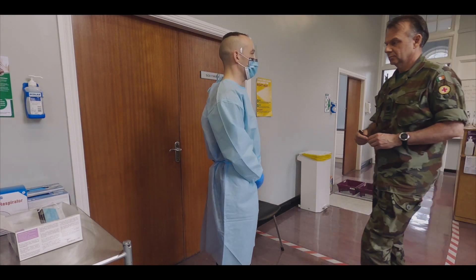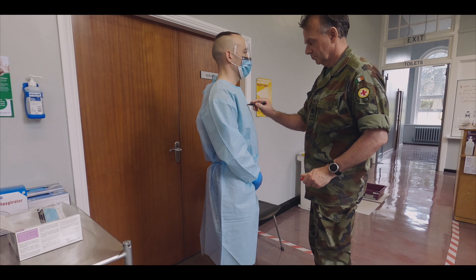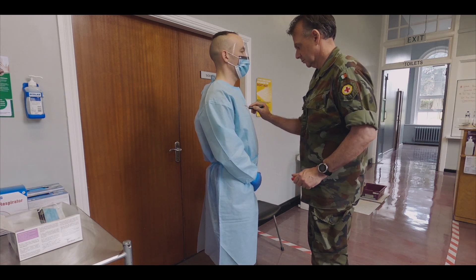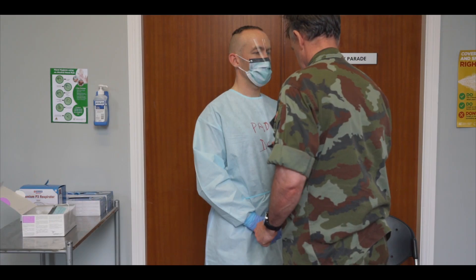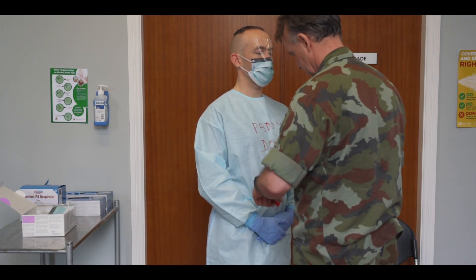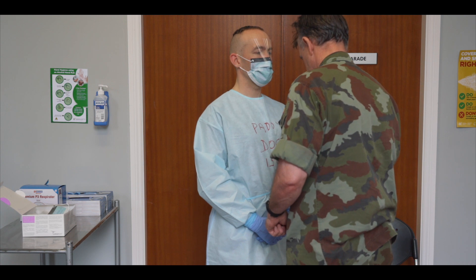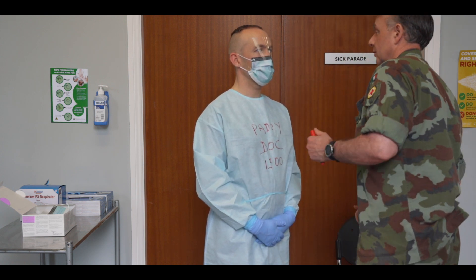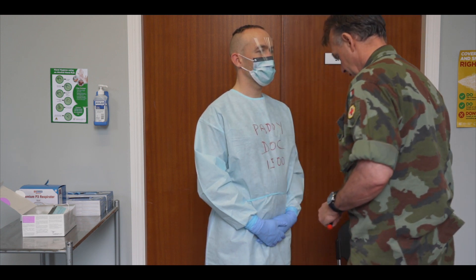The PPE monitor will write your name, job role and the time you will leave the red zone on your apron. The time spent in PPE will be determined based on local conditions such as temperature and workload. The PPE monitor will now inspect that your PPE is correctly worn and has no defects.